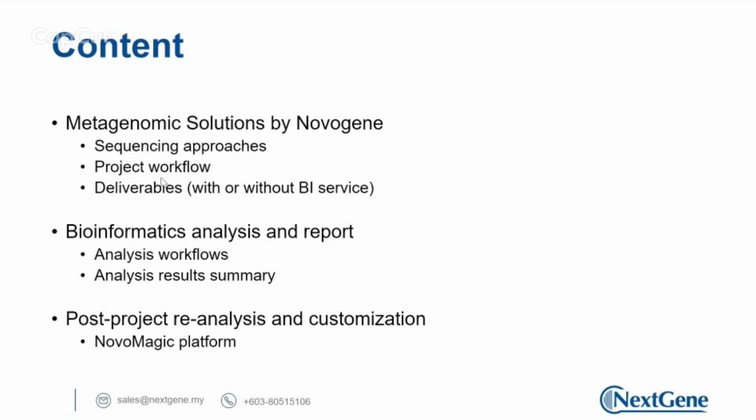So continuing on, I would also want to show you how a project looks like if we are running some metagenomics NGS-based projects, and what we should be expecting from a metagenomics sequencing project. For each of the projects, we'll be getting reports to have an overview of how the project goes. So in this session we will be focusing more on the bioinformatics analysis project reports, to see what kind of data or information we can get from a metagenomics project.